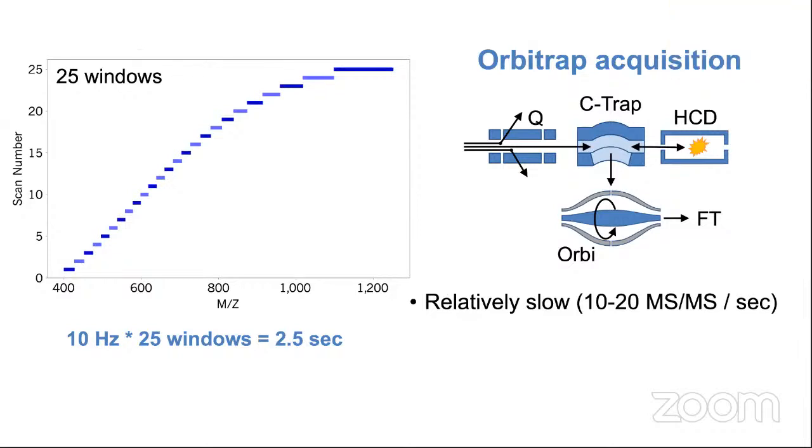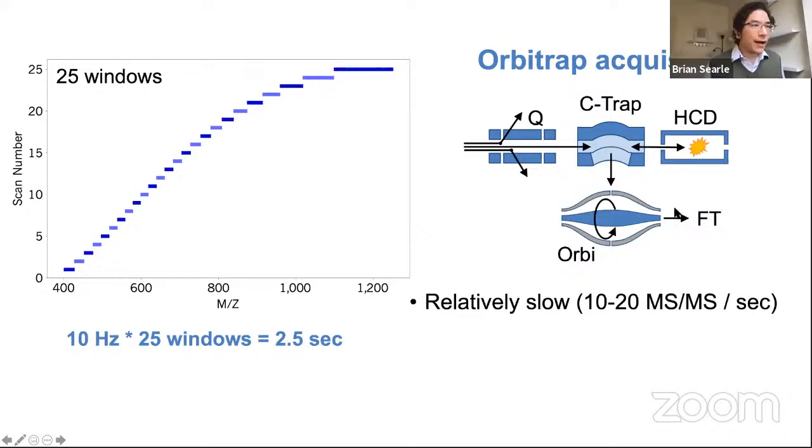Brian, there's a question about TOF. How much scan time should I set, or at least a reasonable time? 0.3, 0.5, 1 second? Again, that really depends a lot on the specific TOF that you're working with. That one is worth talking to the specific vendor about. If you're working with SCIEX or Agilent, you should talk to the vendor about how to configure the instrument on those specific TOFs. Again, remember the constraints that we've got, where you need to be able to make the same measurement every 2.5 or 3 seconds.